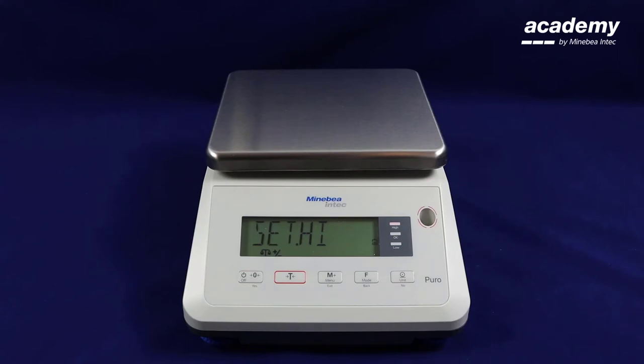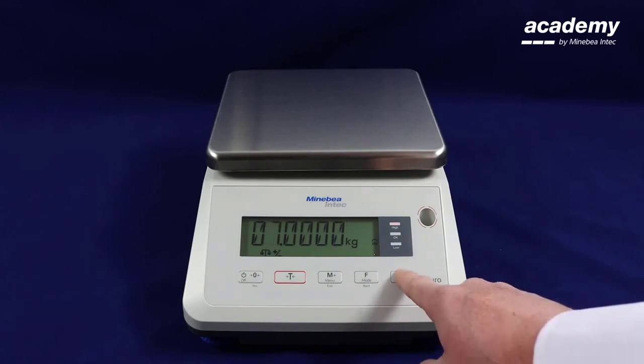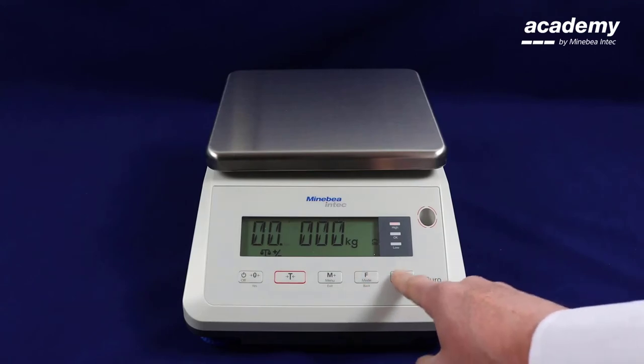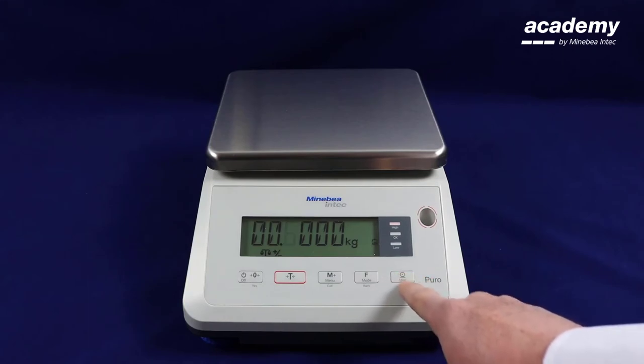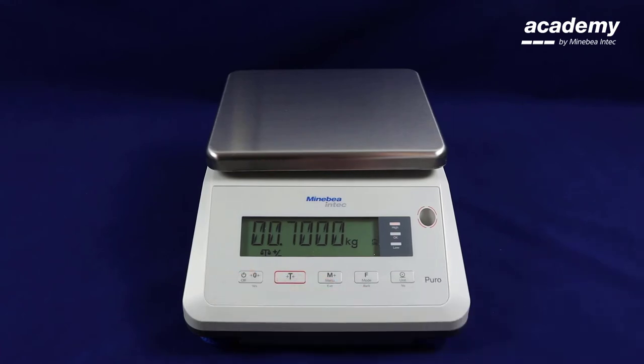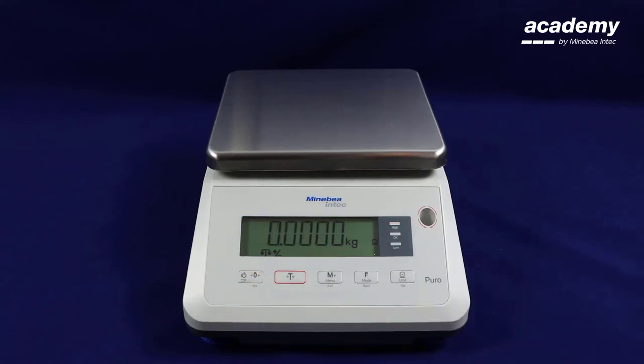Now it is requesting that you set the higher limit. Press yes and repeat the same process. Again press yes to move along and to accept, or use the no and back keys to change the digit. Once you are happy that you have set the higher limit, continue to press yes and again all the digits will flash. Press yes again and this limit is now set.